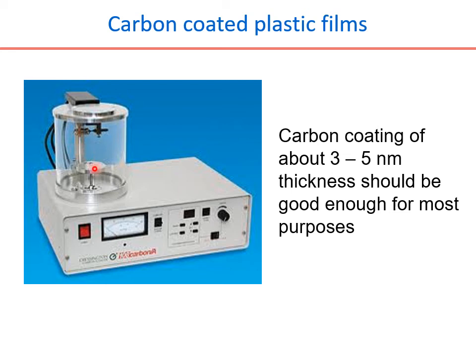The next precaution that has to be followed is that a freshly glow discharged grid has to be taken for the experiment. That means, I did the glow discharge today, can I use it tomorrow? No, because the charge that has accumulated on the carbon surface is transient in nature, and it will fade over time. So typically it has to be used within 15 to 20 minutes. Once you do the glow discharge, the grid has to be used between 15 to 20 minutes.